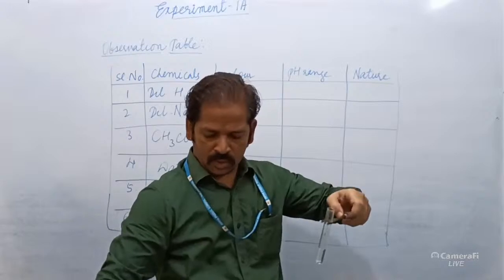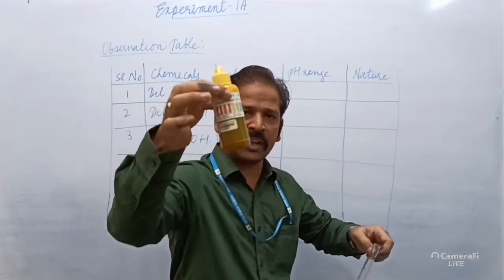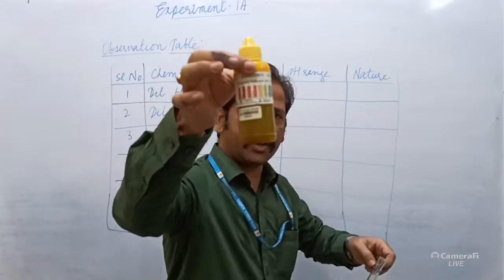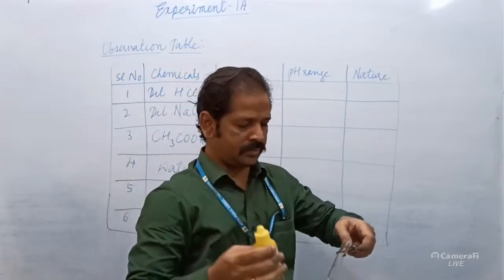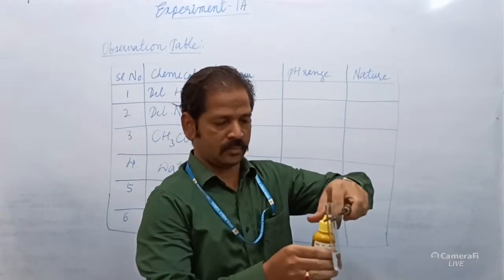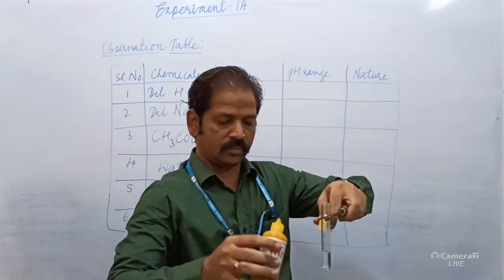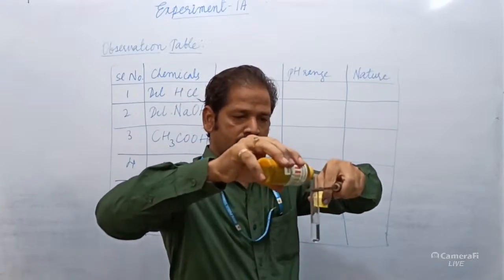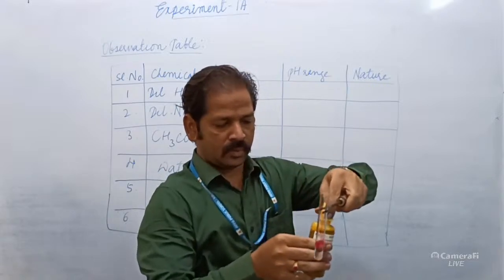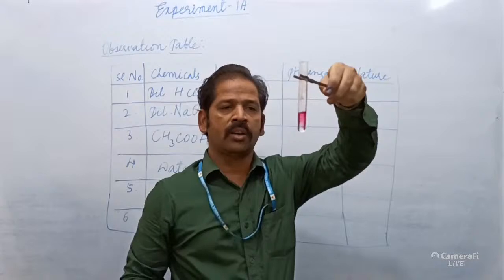It is the universal indicator. Here the different colors are mentioned on it, a pH chart. Yes, so we have got the result.